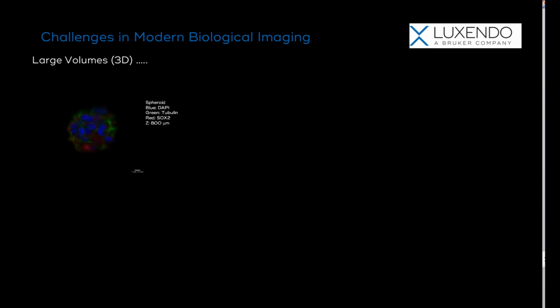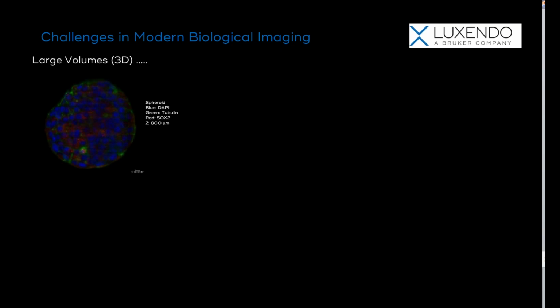So researchers are constantly asking increasingly complex questions and developing applications, and this requires instrumentation being able to keep pace. There's been an increase in the number of labs that are utilizing whole organisms, such as 3D cell cultures and other physiologically relevant systems.